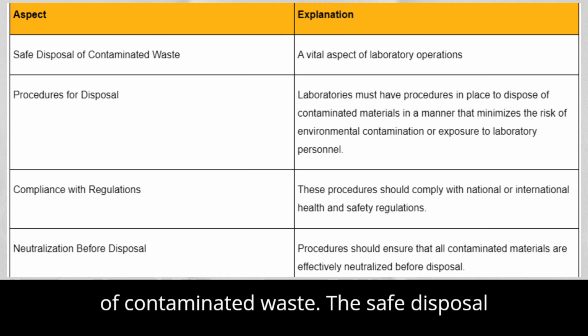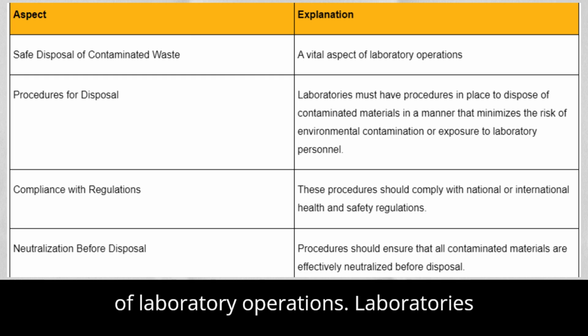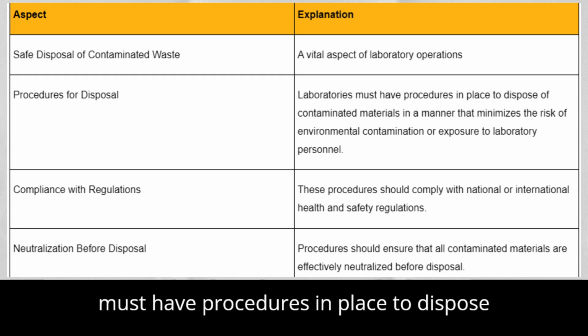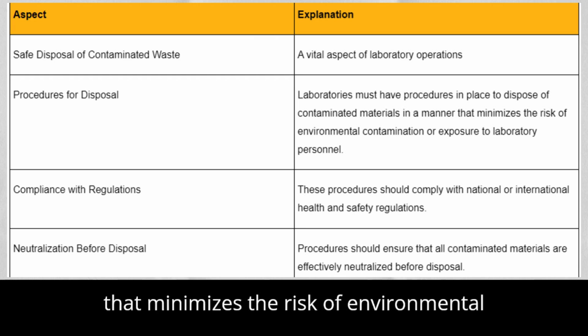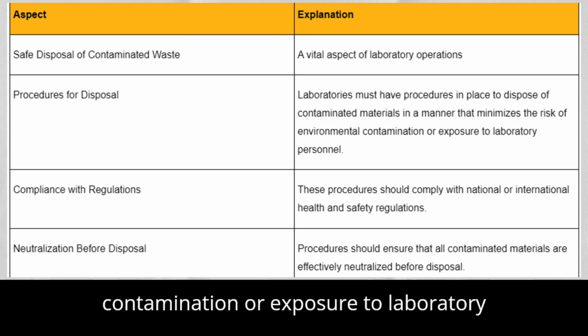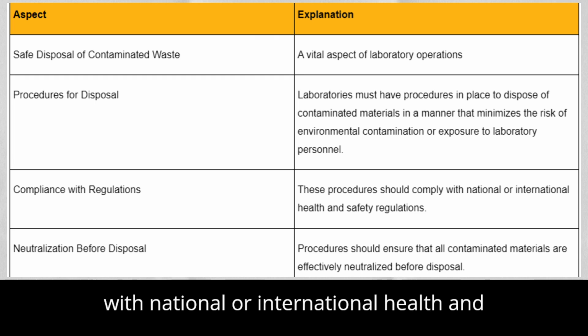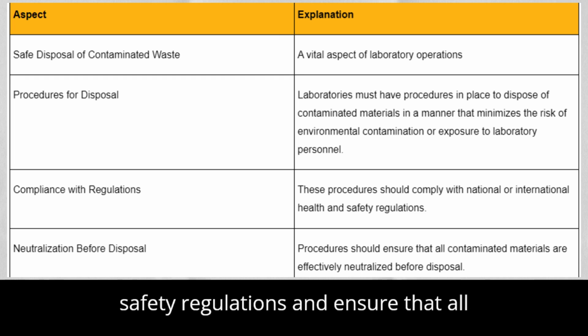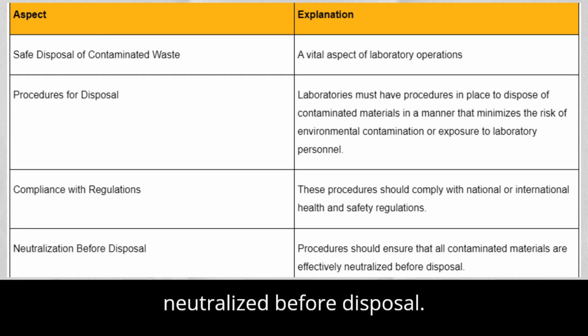The safe disposal of contaminated waste is a vital aspect of laboratory operations. Laboratories must have procedures in place to dispose of contaminated materials in a manner that minimizes the risk of environmental contamination or exposure to laboratory personnel. These procedures should comply with national or international health and safety regulations and ensure that all contaminated materials are effectively neutralized before disposal.